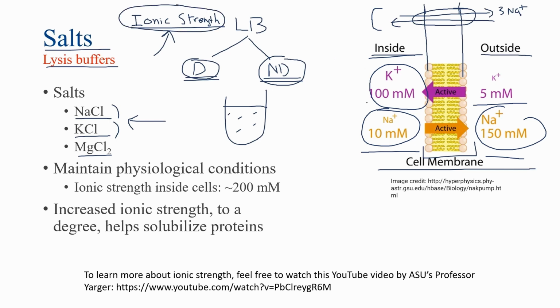And so one of the functions of using salts in lysis buffers is to maintain physiological conditions, give or take. So the ionic strength inside the cells is roughly 200 millimolar. And what we're doing in composing lysis buffers with salts in them is we are trying to mimic the ionic strength that is inside the cells.